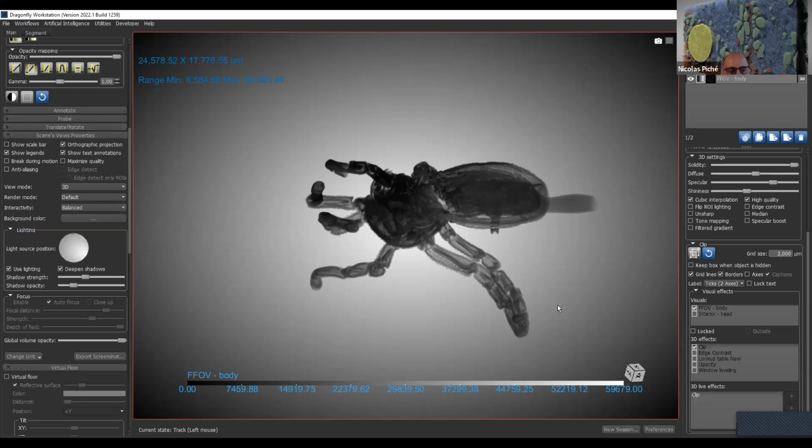Okay, a voxel can be any type of rectangular shape object. So it's unusual to have an X, Y difference. There's not a lot of acquisition protocols that give you that. But when you do a derived series, since we optimize the sampling and all that, if you're in an oblique, you will have different types of spacing in each direction.